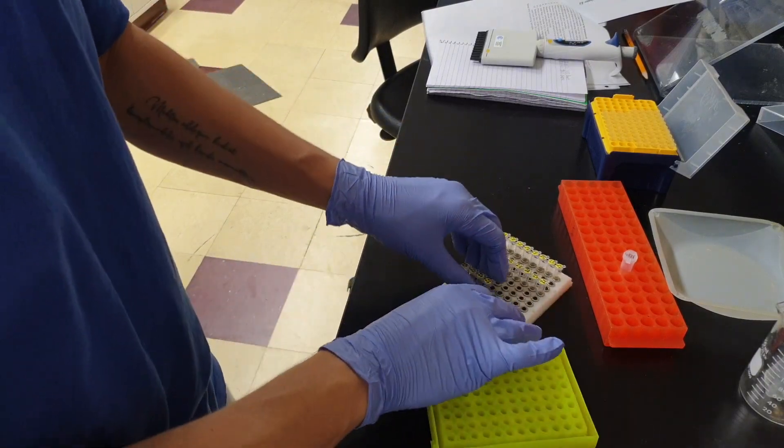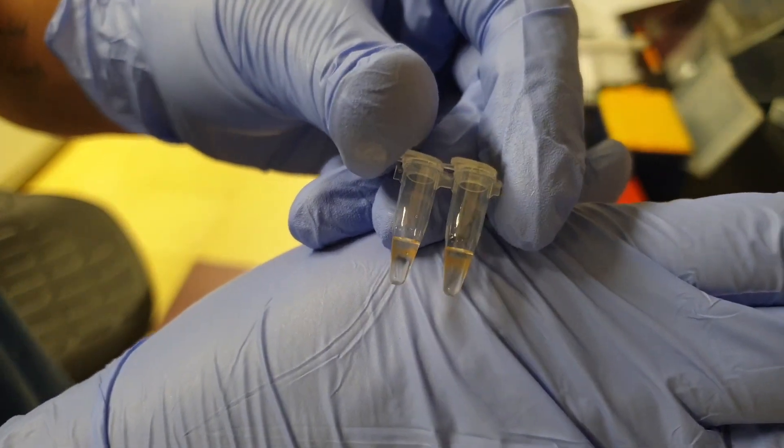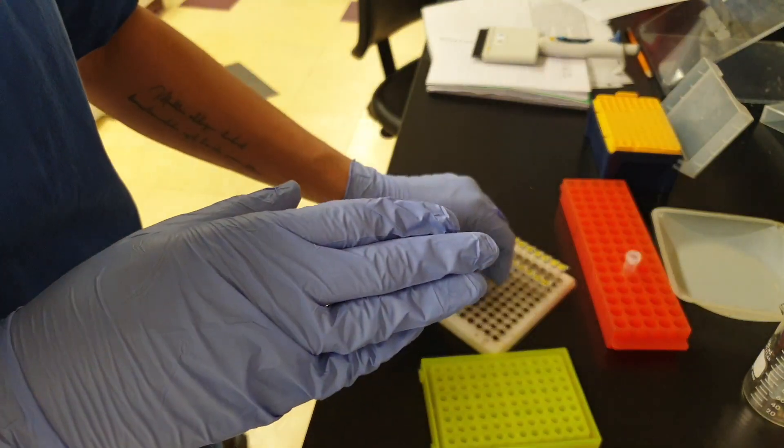We'll let it sit for 5 minutes. After about a minute, this is what it's going to look like — there's a ring formation happening. This is what we like to see.